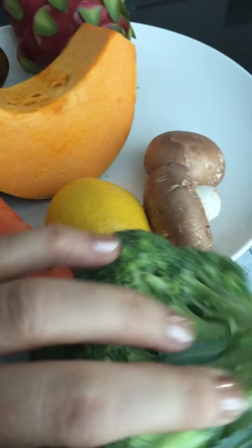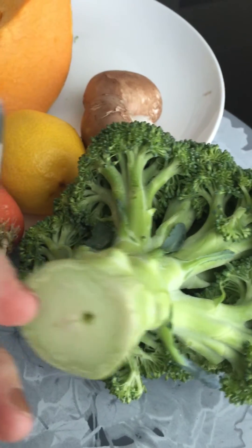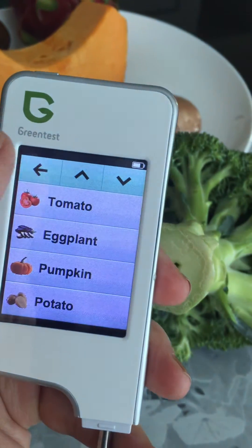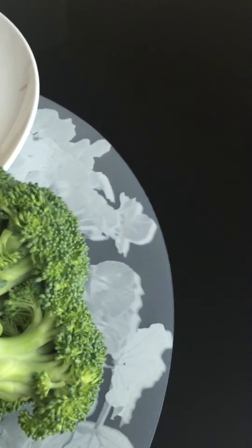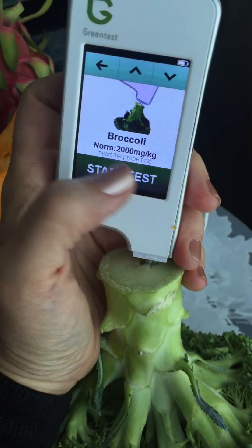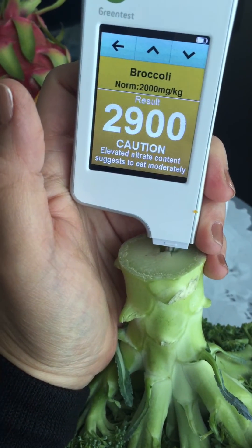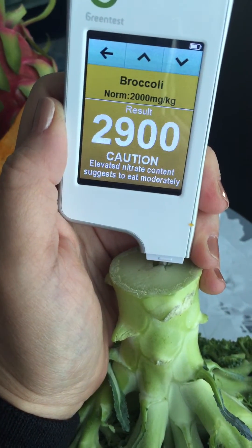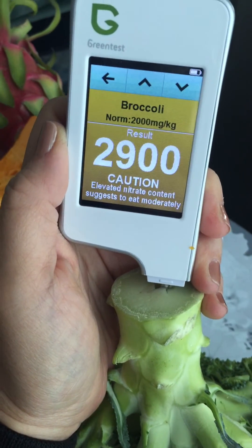Let's do all the vegetables in this video, and later I might do one for the fruit — maybe tomorrow. Let's go broccoli. The non-organic broccoli is a no-go — it's showing amber, elevated nitrate content. So eat moderately.